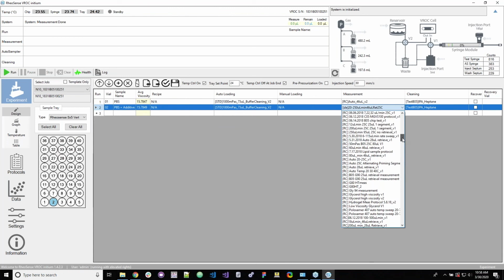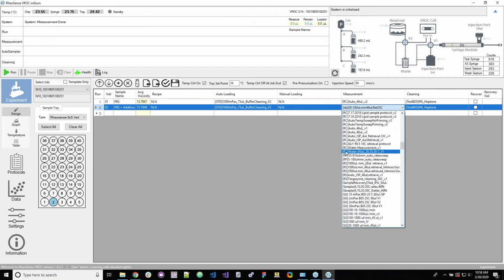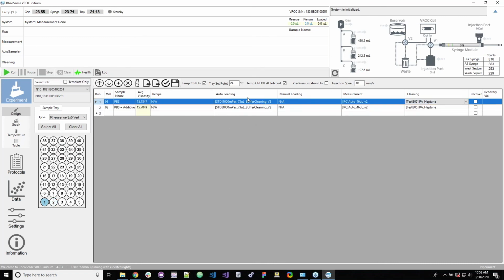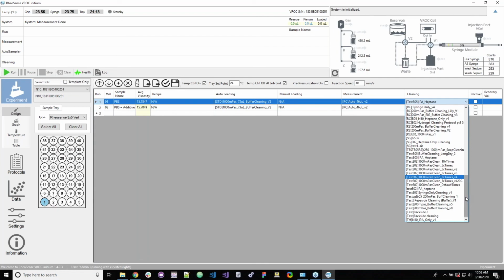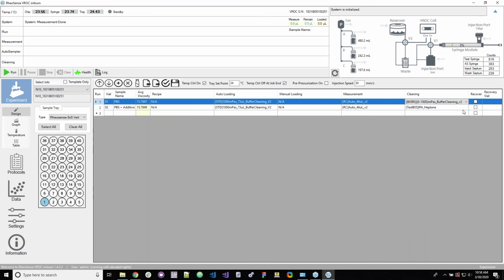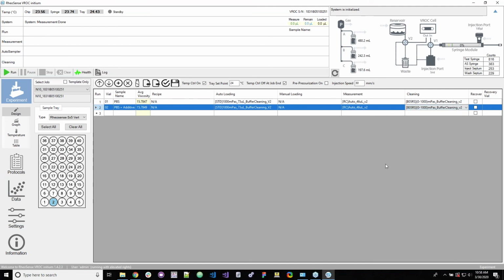So we will again look for automatic mode. And then for cleaning, we want again to match the type of cleaning, so buffer cleaning. So we want this cleaning to match that as well. So we want to have both buffer cleaning selected and the chip type selected. So we want buffer cleaning and B05 since we're running on a B05 chip. So we will do the same here. Excellent. So this is setting up an automatic run.